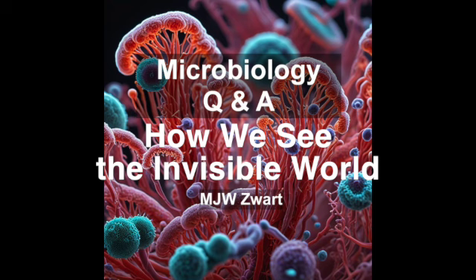So it's like adding color to a black and white sketch. Exactly. Suddenly, the details pop. So it's not just about magnifying the image. It's also about highlighting the important features, so we can actually see what we're looking at. And there's a wide array of staining techniques, each designed for specific purposes.